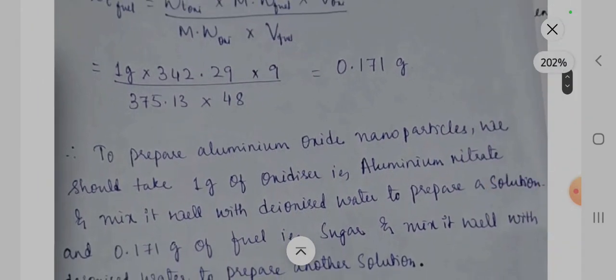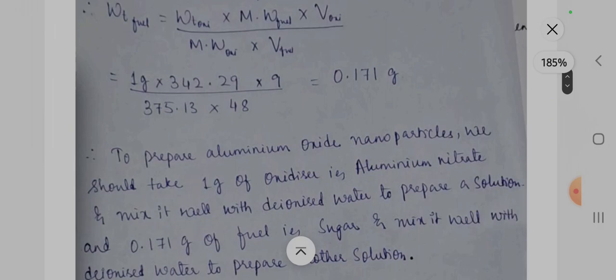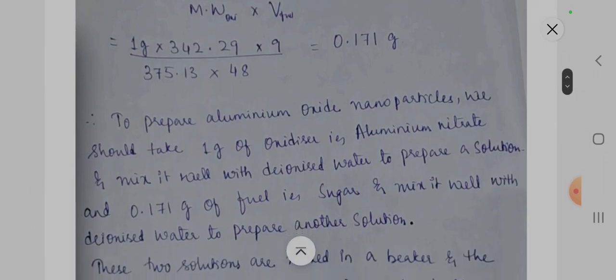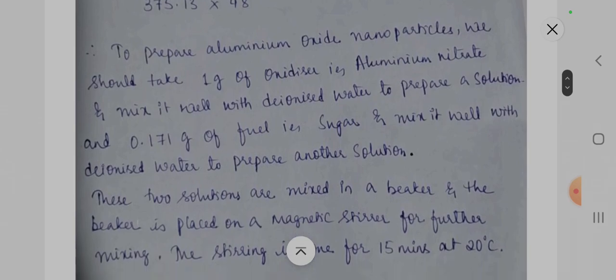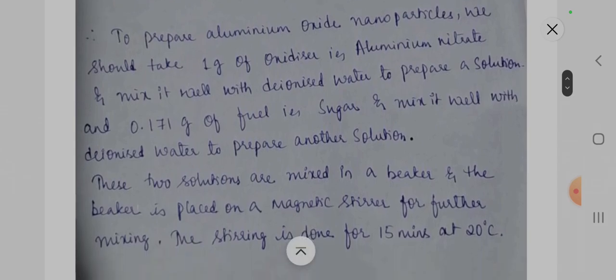To prepare aluminium oxide nanoparticles, we should take 1 gram of oxidizer, that is aluminium nitrate, and mix it well with deionized water to prepare a solution, and take 0.171 gram of fuel, that is sugar, and mix it well with deionized water to prepare another solution. These two solutions are mixed in a beaker, and the beaker is placed on a magnetic stirrer for further mixing.